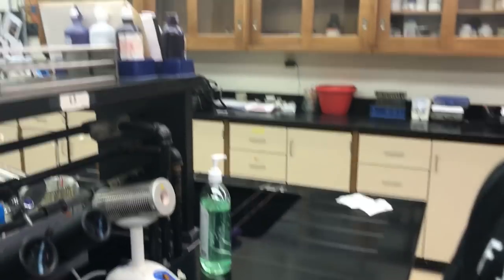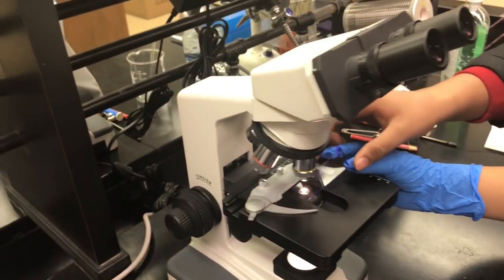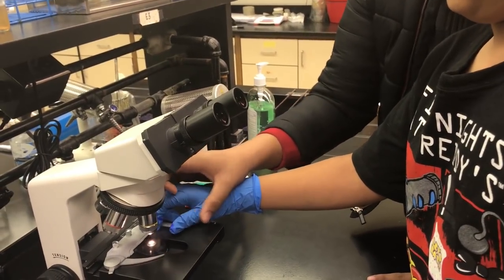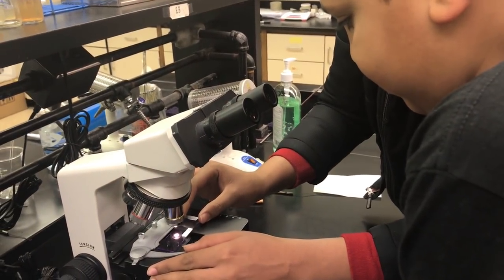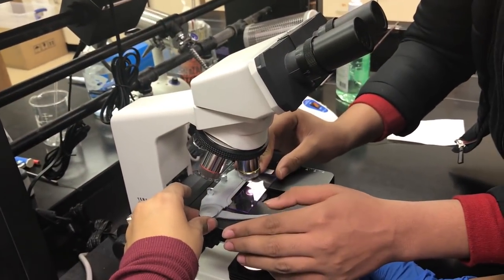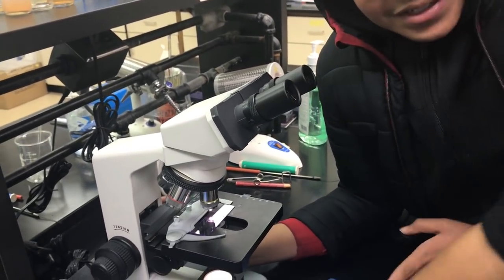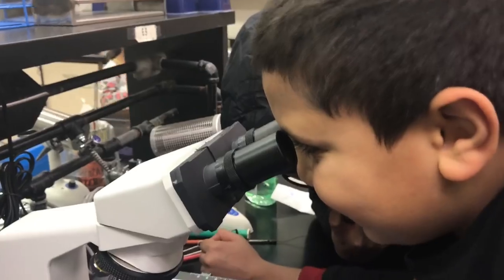All right, so Jordan actually picked Jasmine's yellow plate, her TSA plates. Jaden, you can help him focus the microscope. Jaden, I'm going to take my gloves off because it's very hot inside the gloves. This one's yours, this one's yours. Okay, you have to use the coarse adjustment knob.